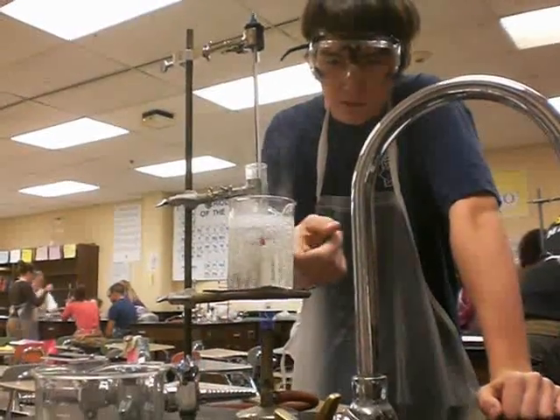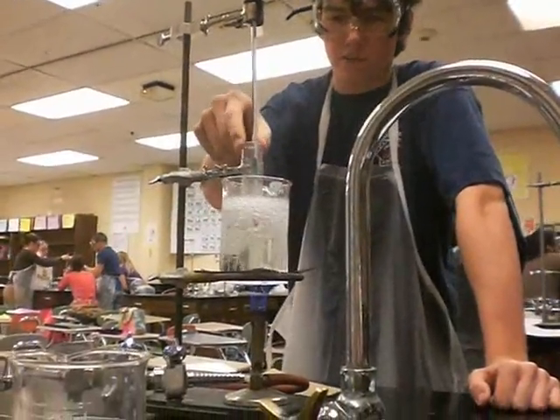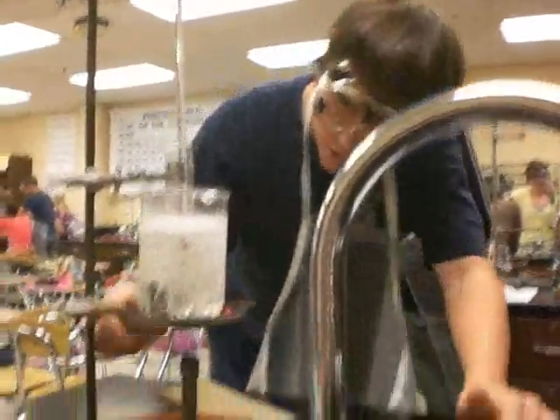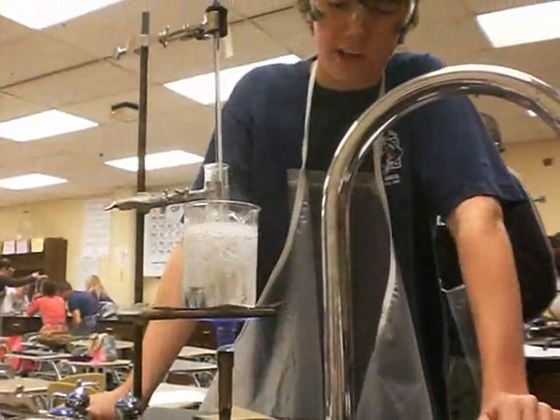We got a bunch of burning right here — burning this water, just water burning. Got some kind of acid in this one right here. It's kind of hot, about 95 degrees Celsius right now inside the tube, and pretty soon the liquid inside this tube is going to solidify.